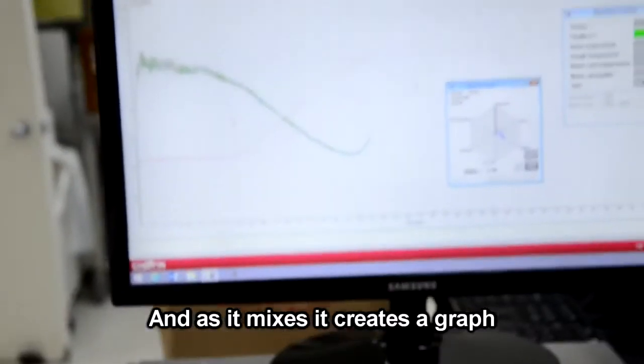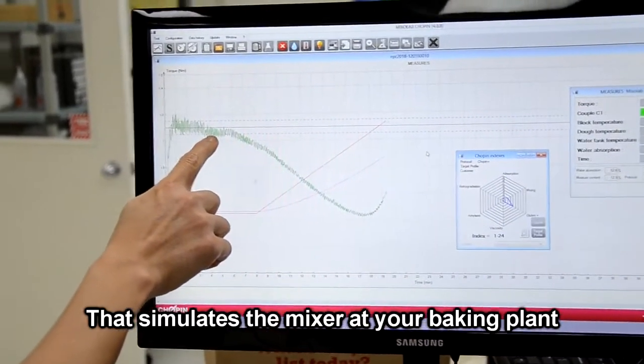As it mixes, it creates a graph that simulates the mixer at your bakery.